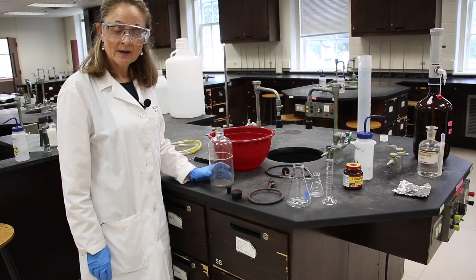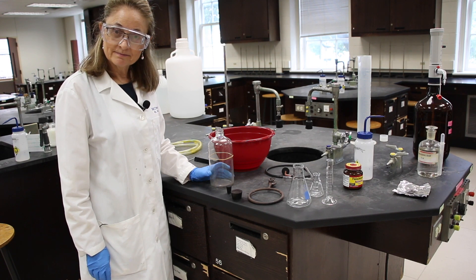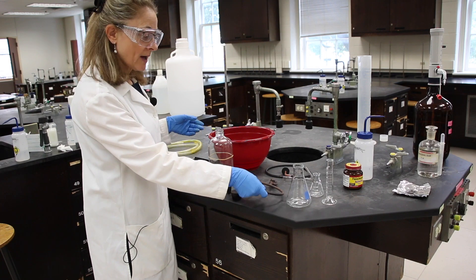Hello and welcome to lab. Today we're going to do experiment 9, gas laws. This one has a little bit detailed setup, so we're going to do that first.